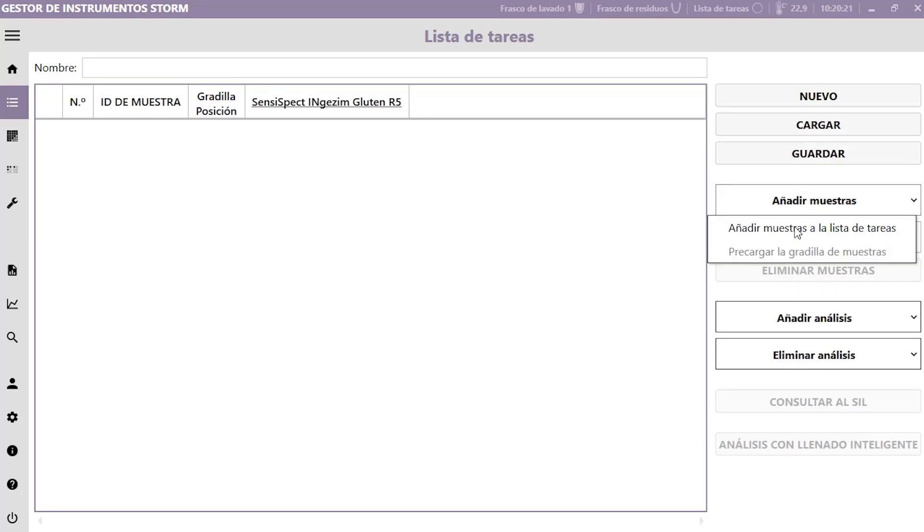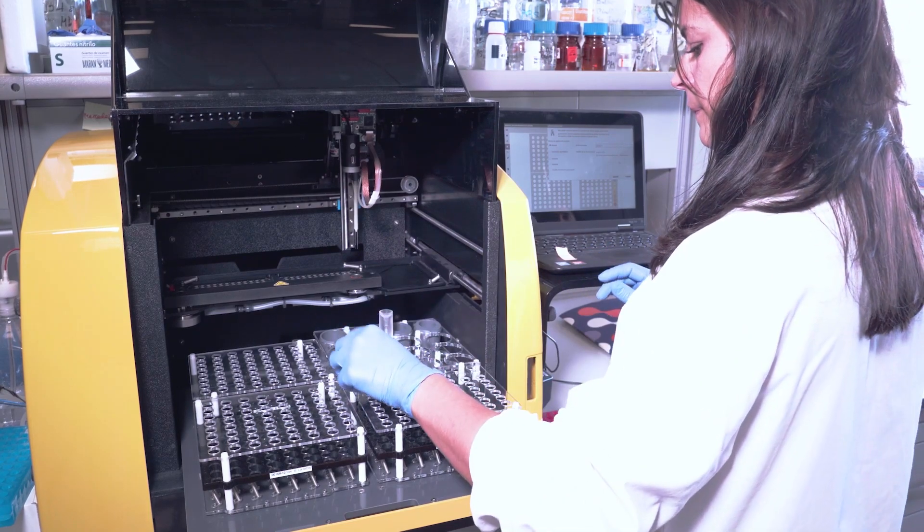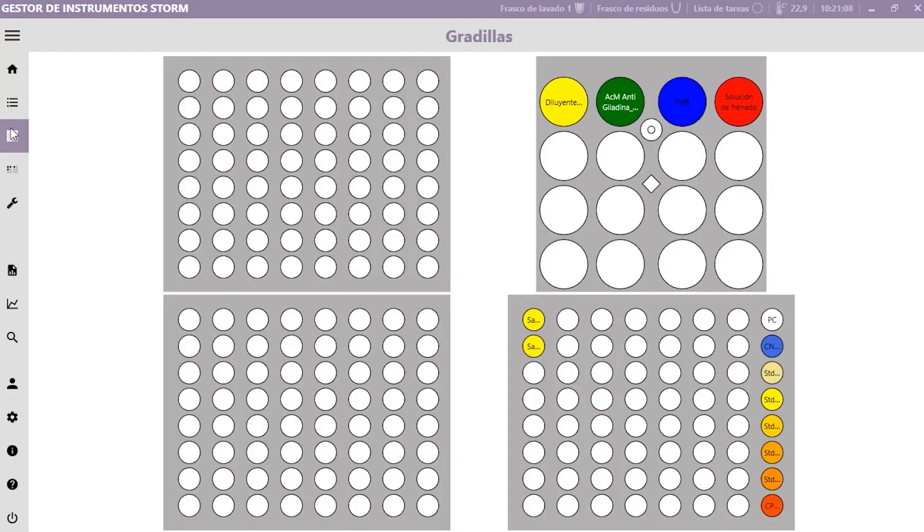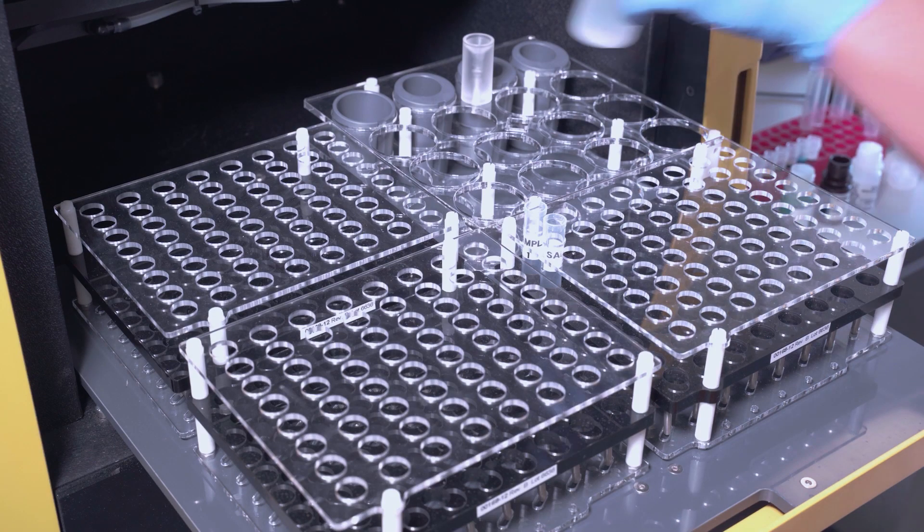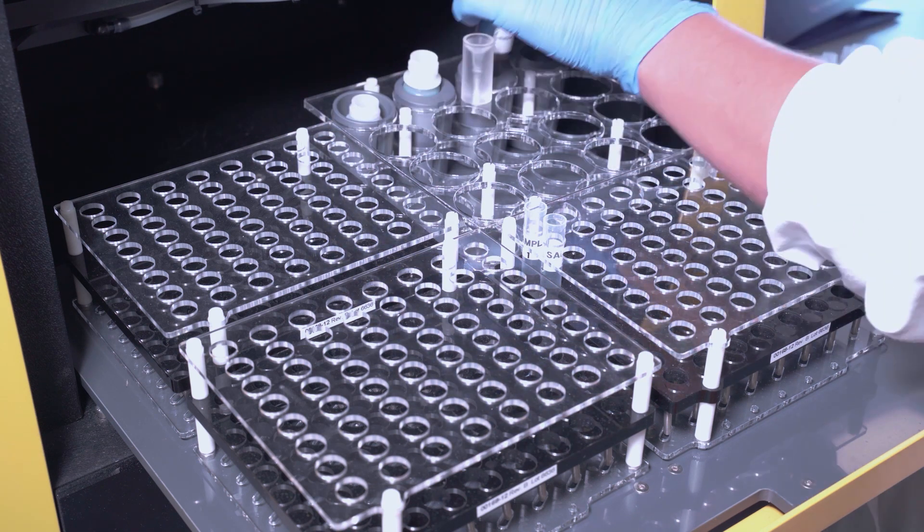Load the gluten program. Select the samples and the correspondent dilutions. Add the reagents and the calibration curve in the correct holes, following the program instructions.